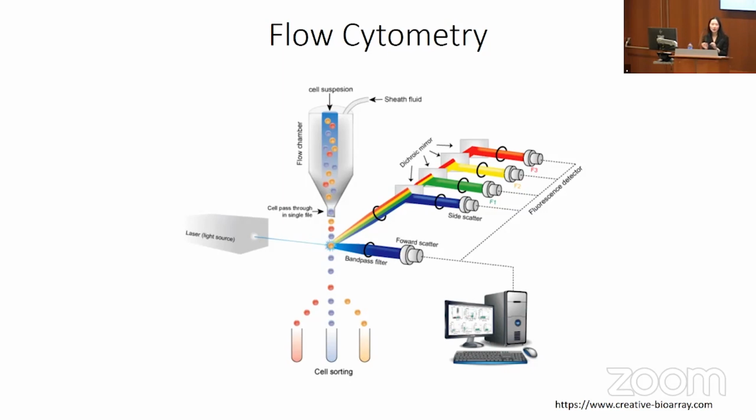So this really only happens in hematologic diseases, because in solid diseases, like say you have stomach cancer, it doesn't easily go into a single cell suspension. So that's why we don't use those tissues for flow, but we use heme tissues for flow because they go into a single cell suspension. It's also why, I should say, it's not all heme malignancies, because Hodgkin lymphoma and some other lymphomas may not flow well either. So it's specifically for heme diseases that flow well.